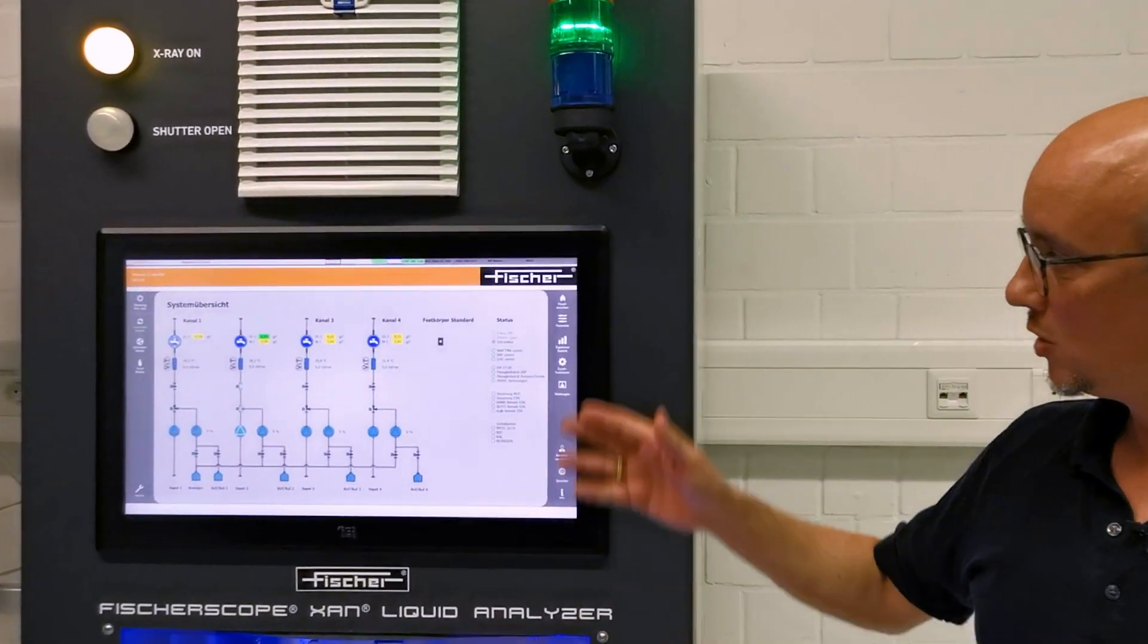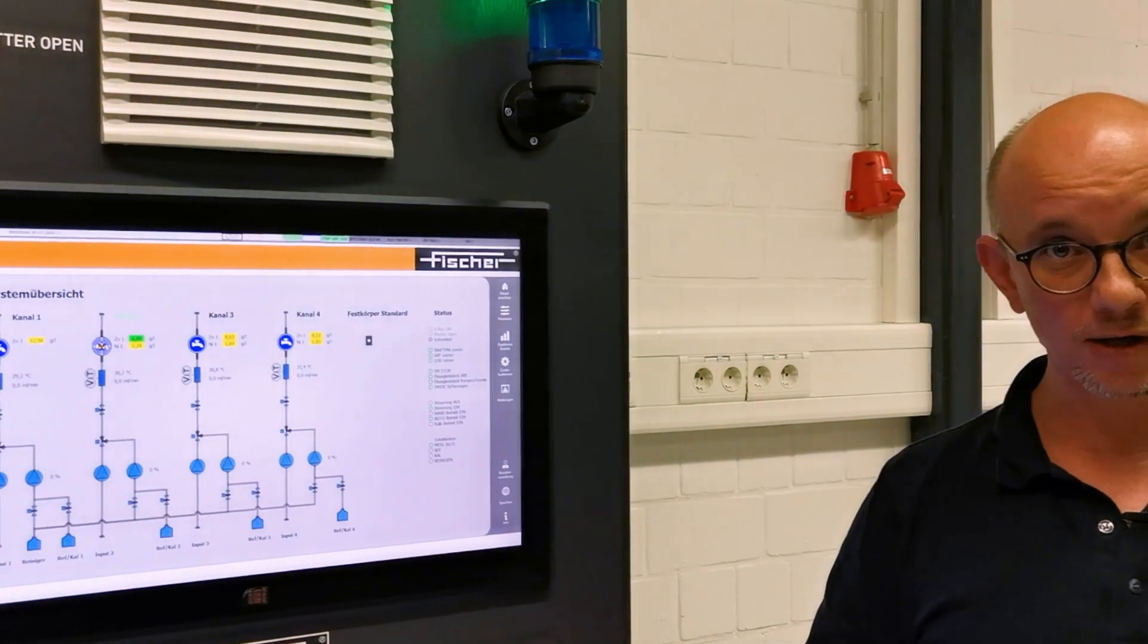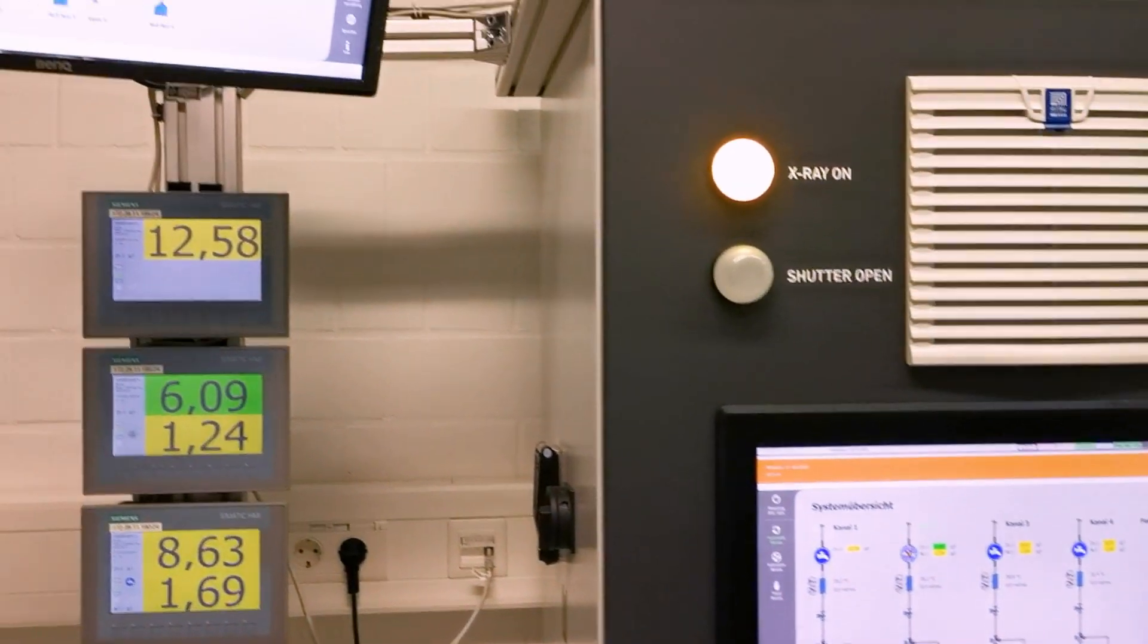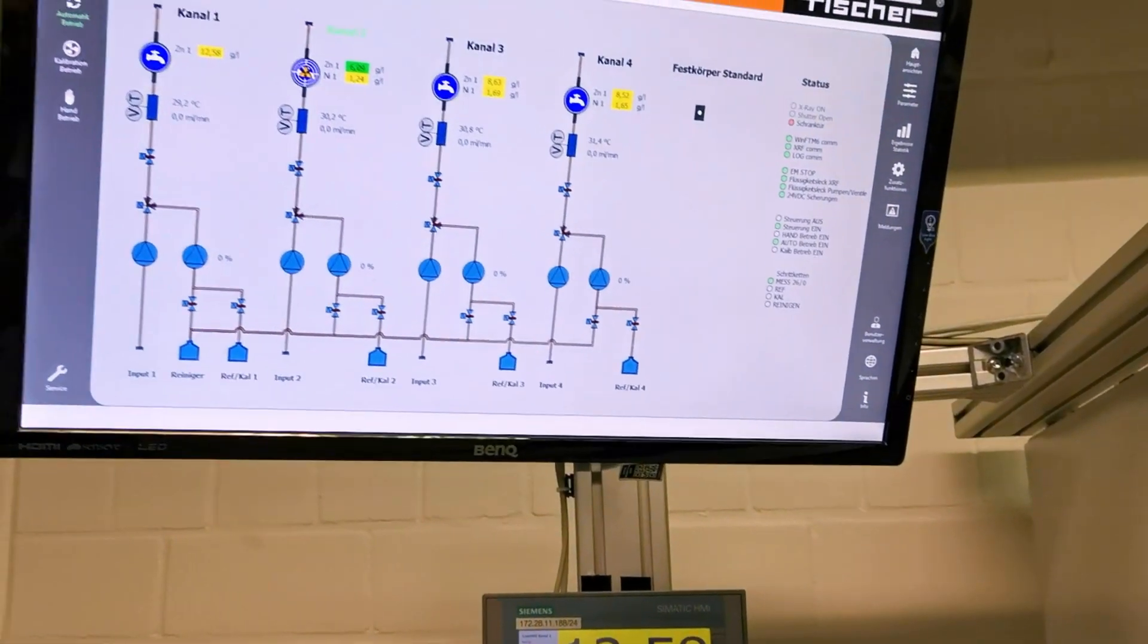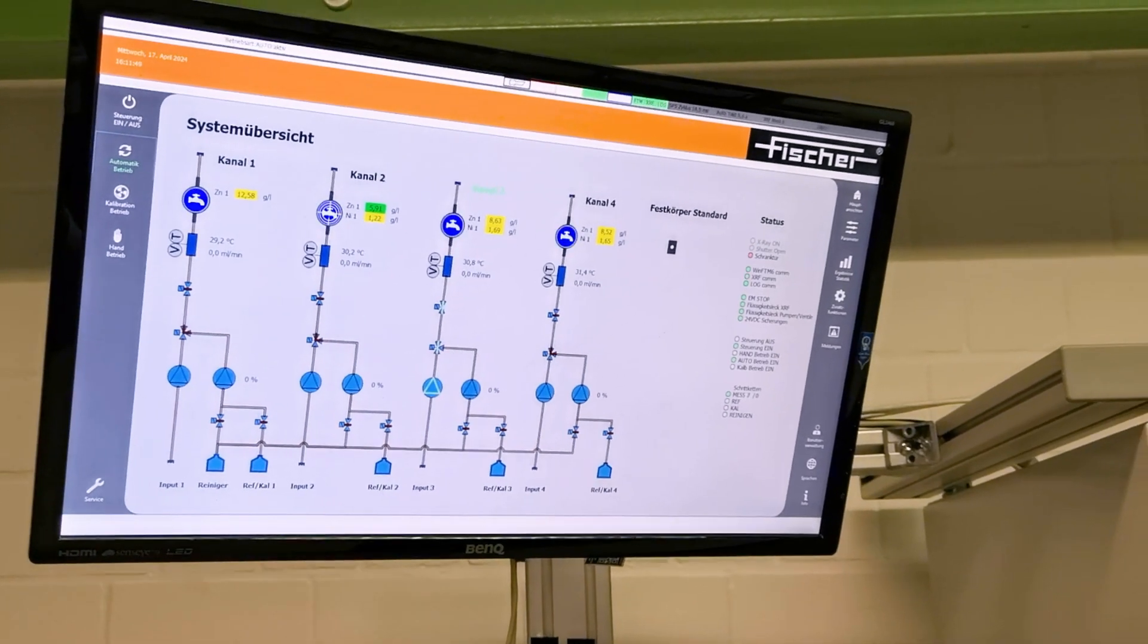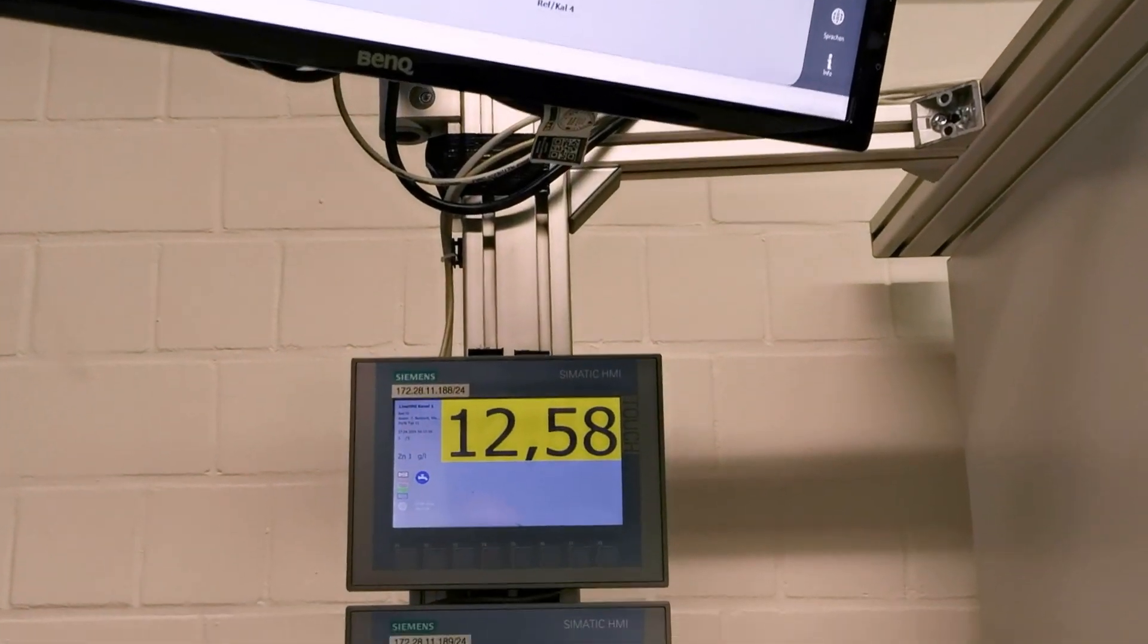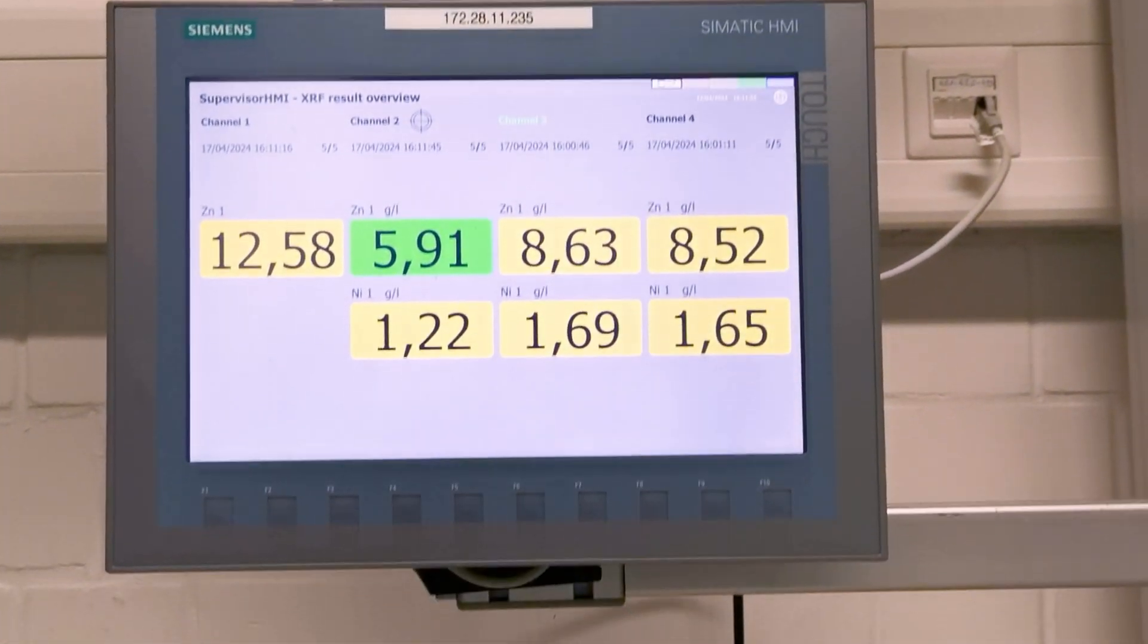We operate it locally or via remote on the large touchscreen or over your network, and we can present the result values on external screens that you see here on the left-hand side—either a large screen on your factory shop floor, smaller screens on the plating lines, or intermediate screens in your supervisor offices.